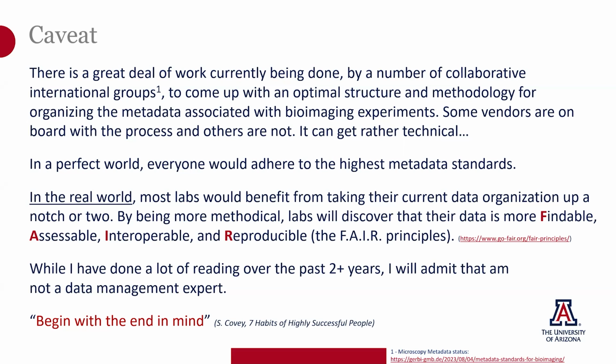Now, I'll admit that even though I've done a lot of reading over the last 2 or more years on data management, I would not consider myself a data management expert. And I hope that this presentation will give you some useful tips and tools to work with. Whenever you think about a project that needs organization, I like to come back to this quote from Stephen Covey, which is one of the 7 habits of highly successful people. And it says, begin with the end in mind.